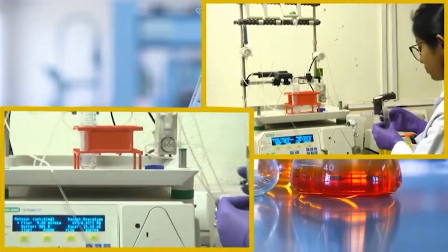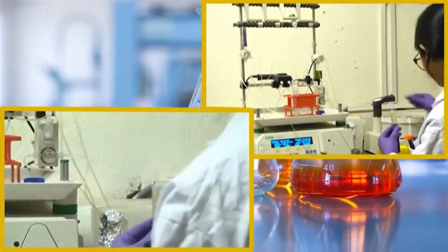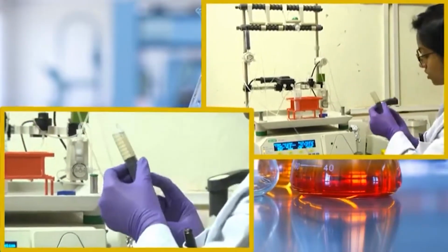So, this is the filtered sample. If you have any kind of bubbles, try to remove the bubbles.